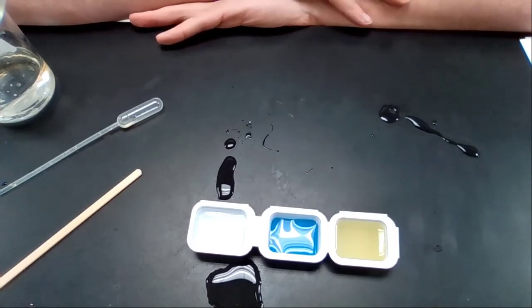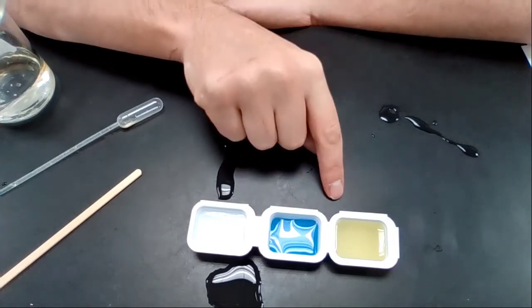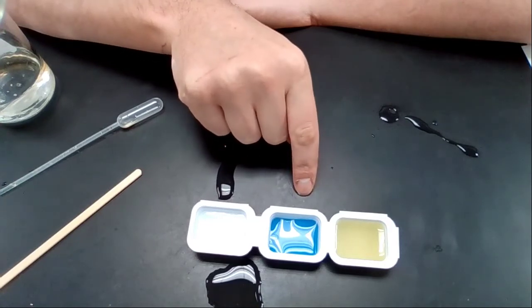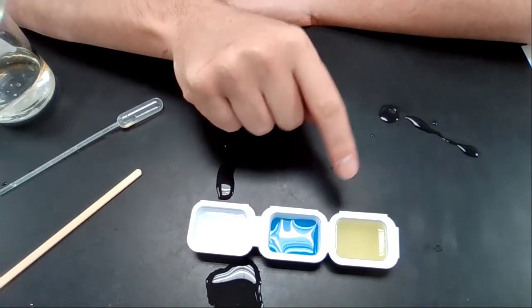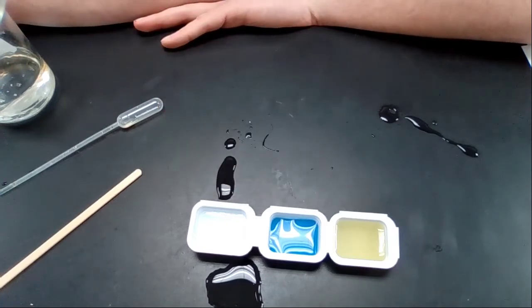You can go through and analyze the rest of the lab. All right. I also want you to think about why not only did it change color to yellow, but why did it eventually go back to blue? Okay. And then eventually at some point, it doesn't quickly go back to blue. So think about those things as you go through, complete the rest of your lab.